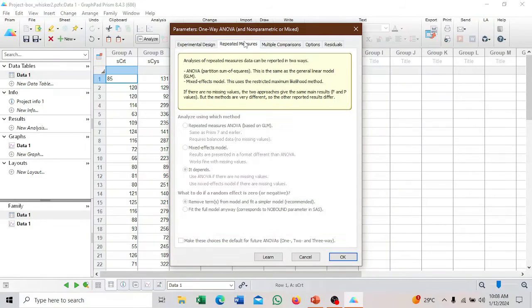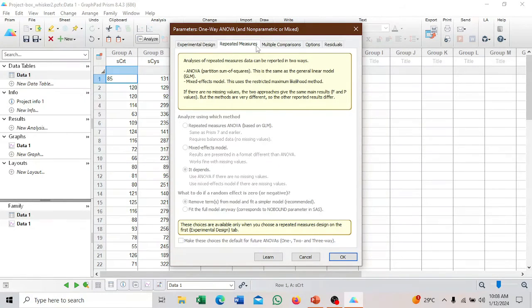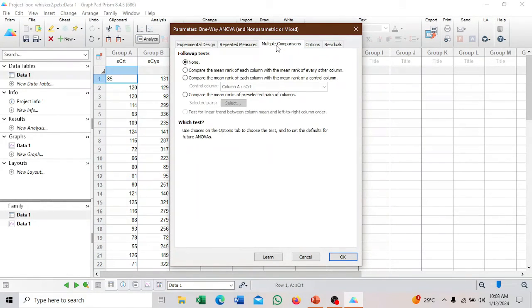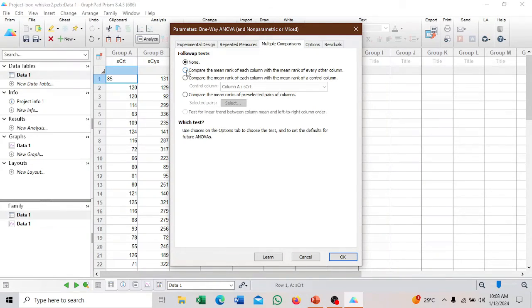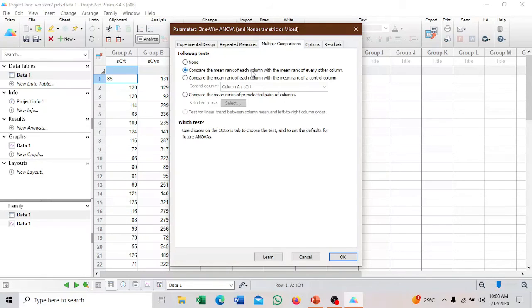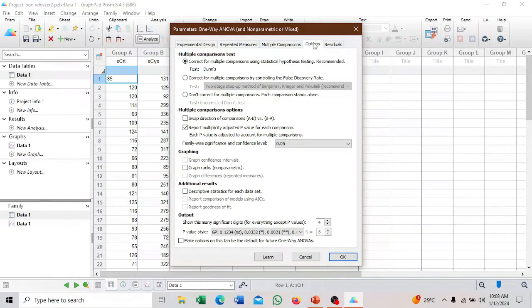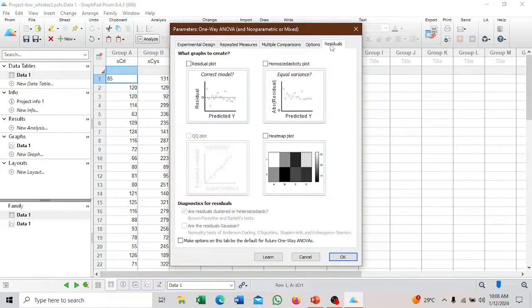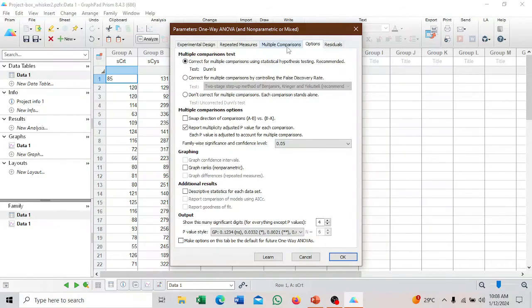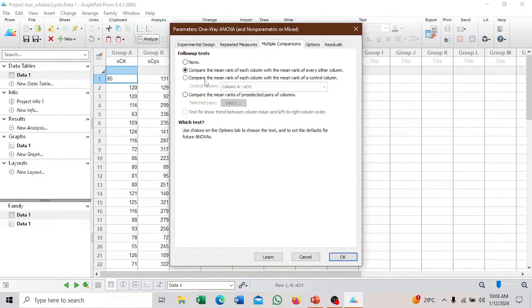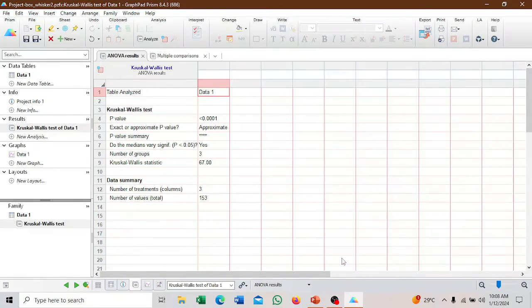Then repeated measures, there's no options. They'll come to multiple comparisons. We want to compare each variable to the other. We'll select compare the mean rank of each column with the mean rank of every column. If you want the residuals and other outputs, you can come here, but for this analysis, we don't need them. Then we'll click OK.